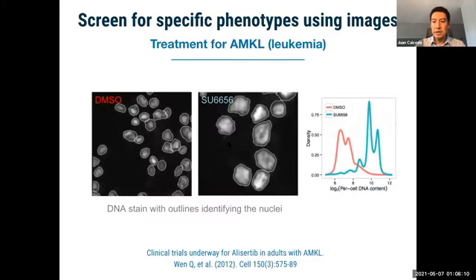So here is an example of the type of measurements that we can make using images. This was a research project that was run a while ago in 2012, in which researchers were looking at a potential drug candidate for leukemia. The hypothesis that they had was, if we take cells that are sick, in this case, red blood cells which are sick with leukemia, and test specific compounds, we can see whether the cells can recover from the disease state.